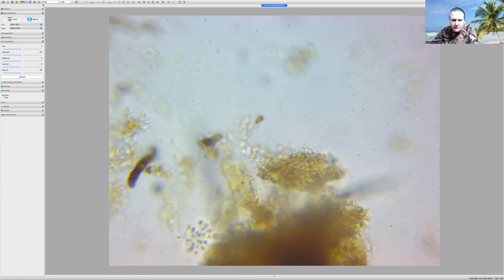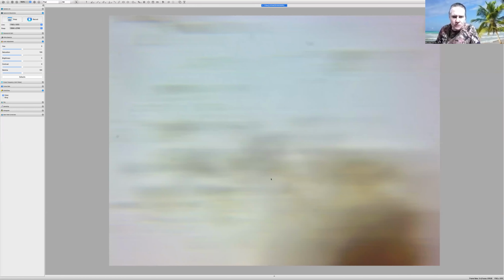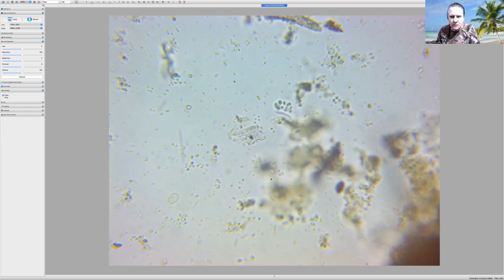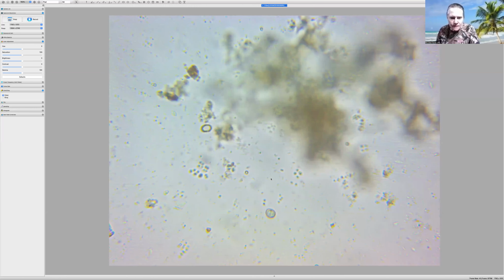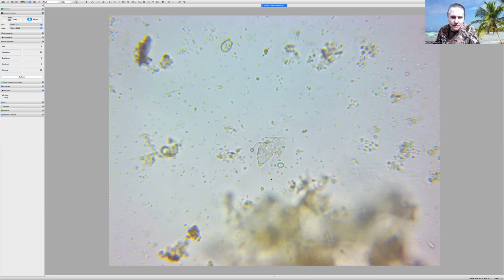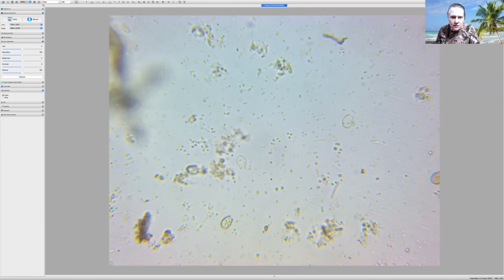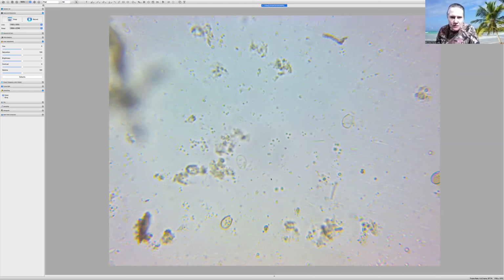Okay, that would just be another species that you can count towards, but this can all be analyzed using electrophoresis, a DNA test, to see how many species you have here. I think that's a little overkill to do, but if you want to know, sounds good, don't it? Let's count how many testate amoebas. There's 1, 2, 3. There are 4 testate amoebas right there in that screen, and lots of flagellates.